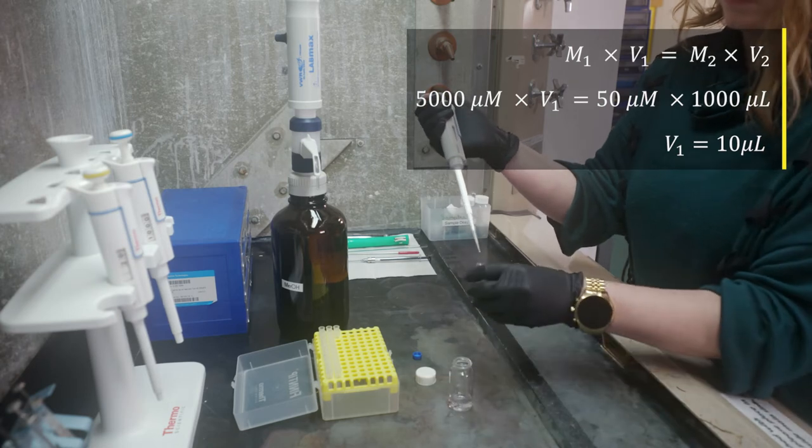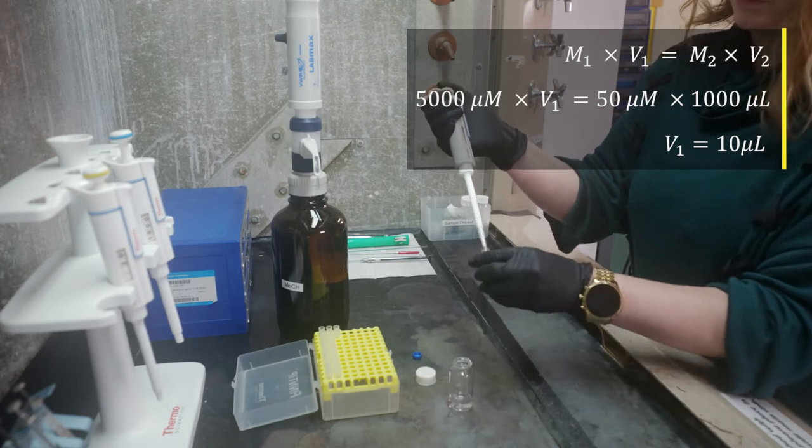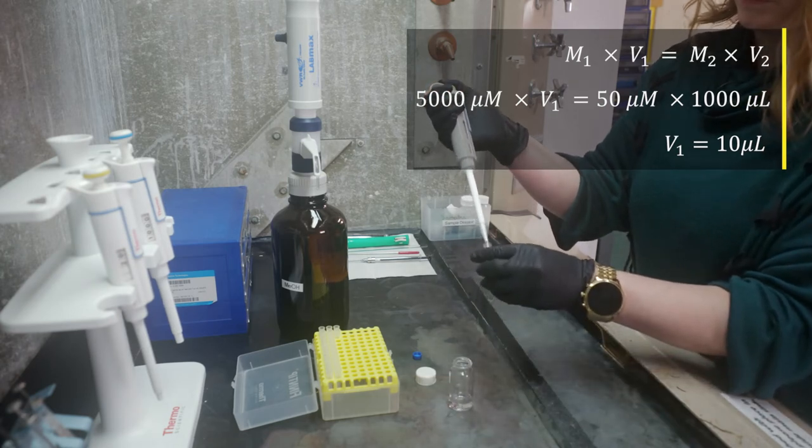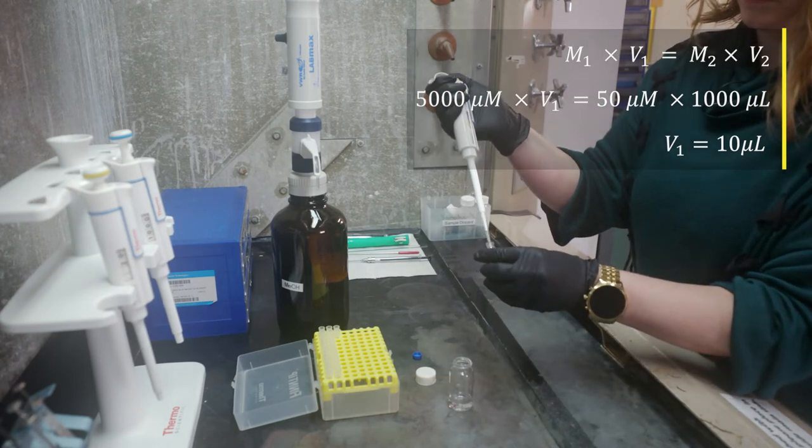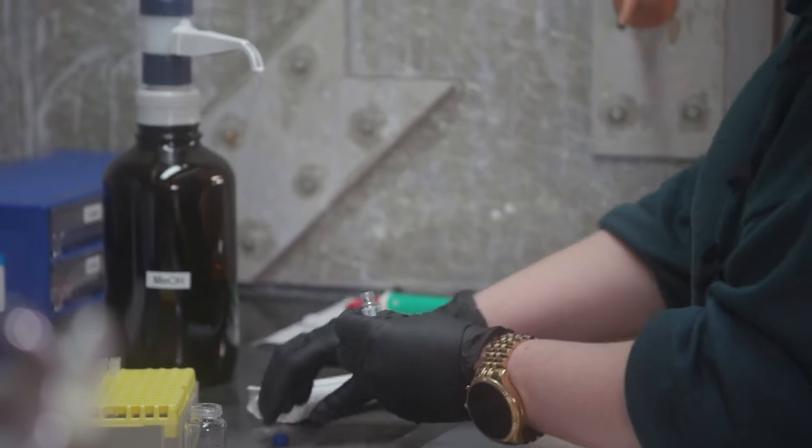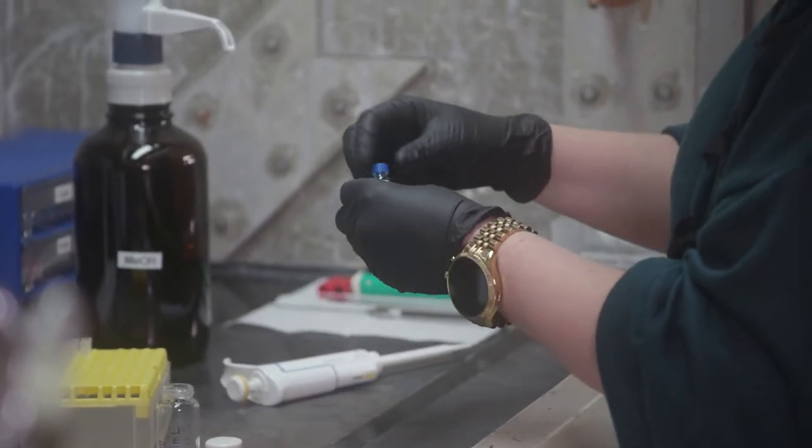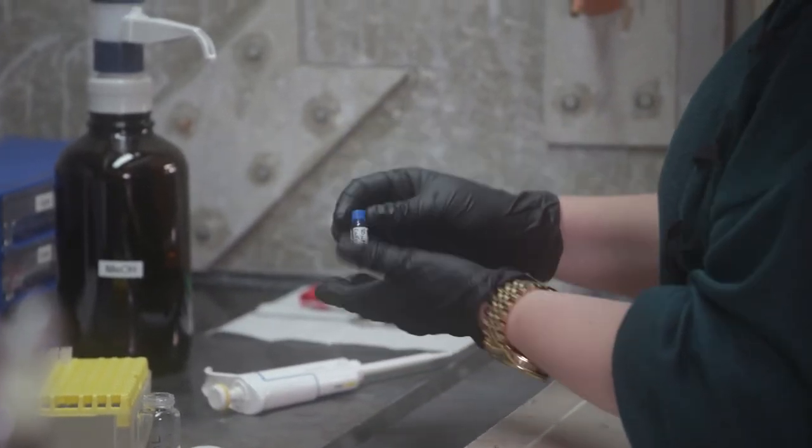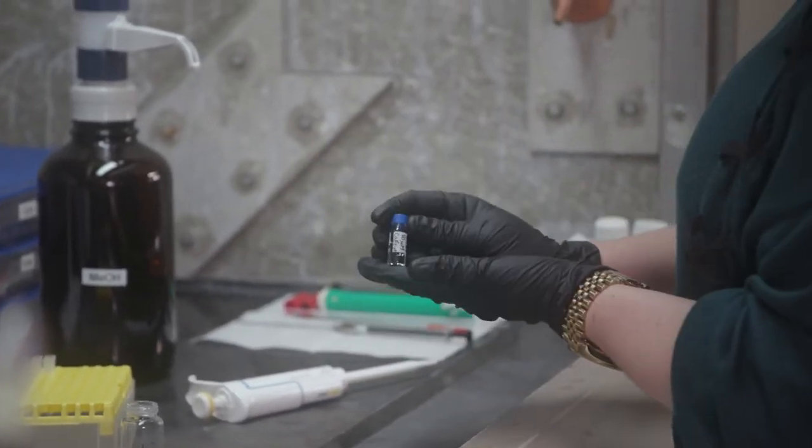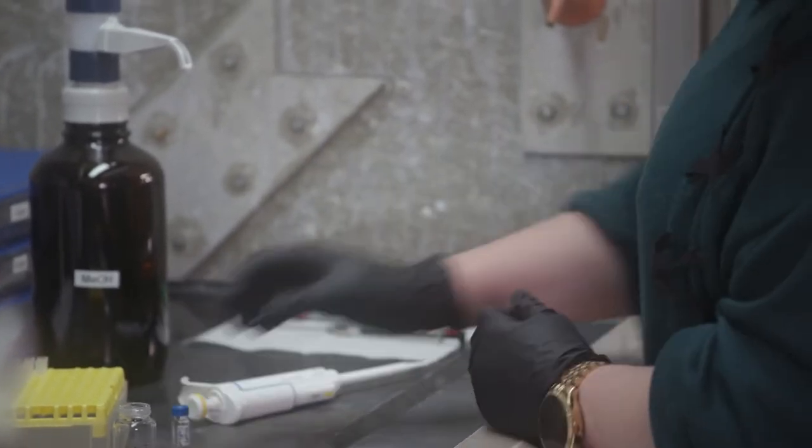To dilute down to 50 micromolar, I'm going to take 10 microliters of my stock solution and dilute it with approximately one milliliter of methanol. Now I have a sample ready for analysis.